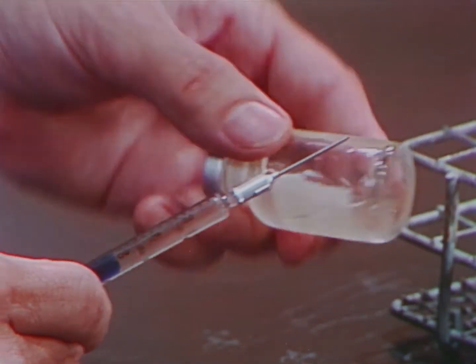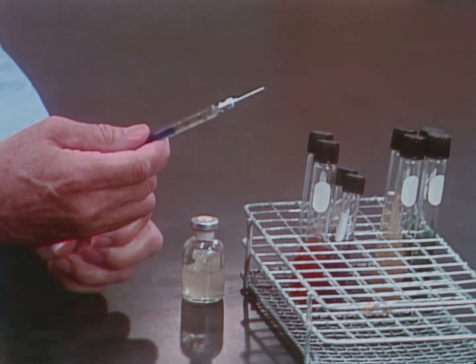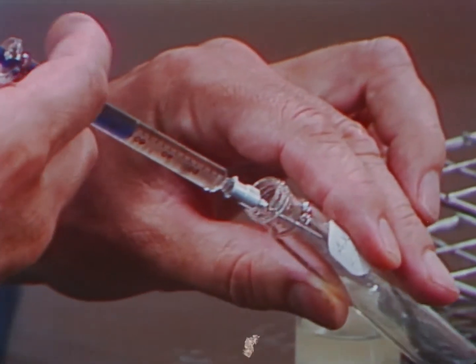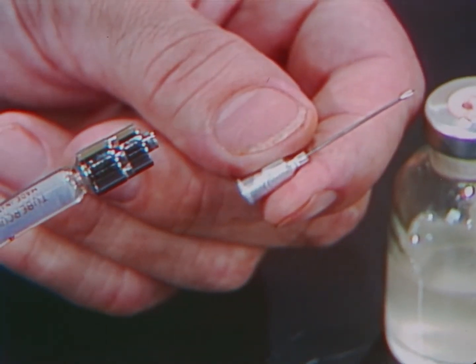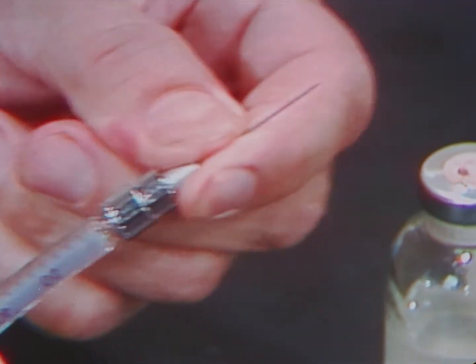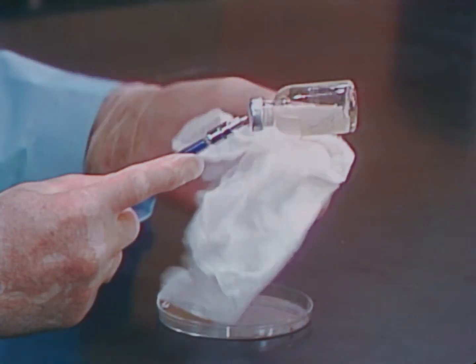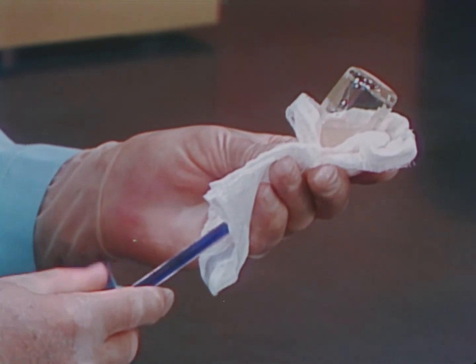Procedures involving the syringe and needle are also potential sources of aerosols. Do not use a syringe as a substitute for a pipette. Accidentally dislodging a needle from a syringe can be especially dangerous. To prevent this kind of accident, use only locking syringes. When a needle is removed from a rubber-stoppered vial, the needle will vibrate, producing an infectious aerosol. Wrapping the stopper and needle with alcohol-soaked gauze considerably reduces these aerosols.